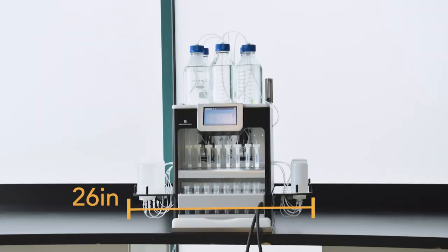Jeff, why don't we get started? Sounds great Ian. What we have here is the SPE03 system. It measures just 26 inches wide, which includes the eight samples that we'll be extracting. That's actually quite compact, because as we all know, it's always a challenge to find benchtop space in labs.